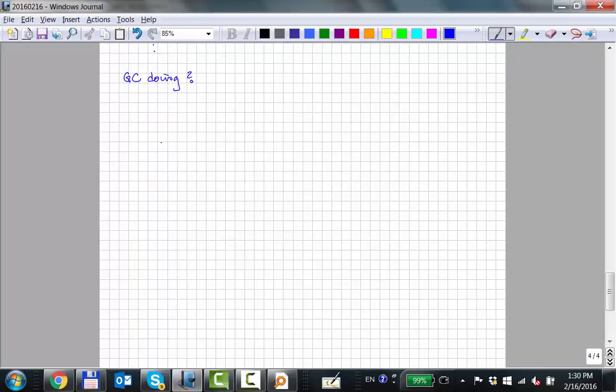So again, this is kind of the lab world according to Curtis, which is not right, but what they do, you got a box, and it's got temperature control, okay? We're controlling temperature in the box, and inside the box, we've got basically a big coil.